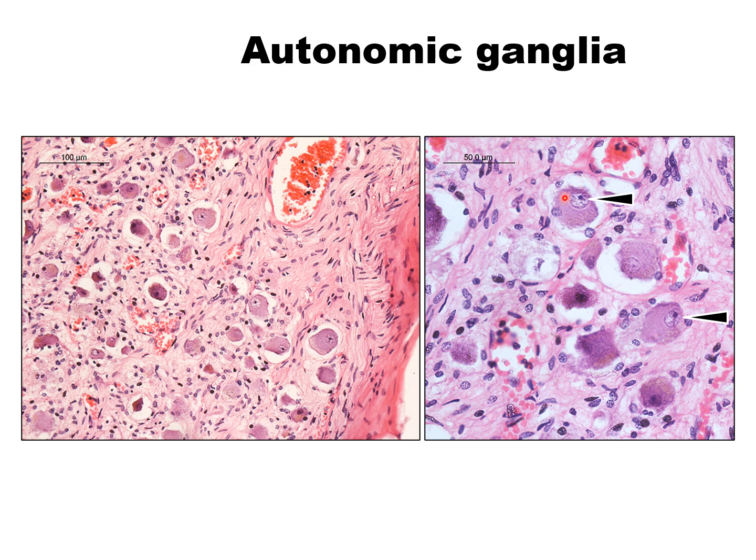So they look irregular in cross section. See, this is the appearance. It is irregular in appearance. Although some of the cells are looking slightly oval, most of the neurons are irregular in shape.